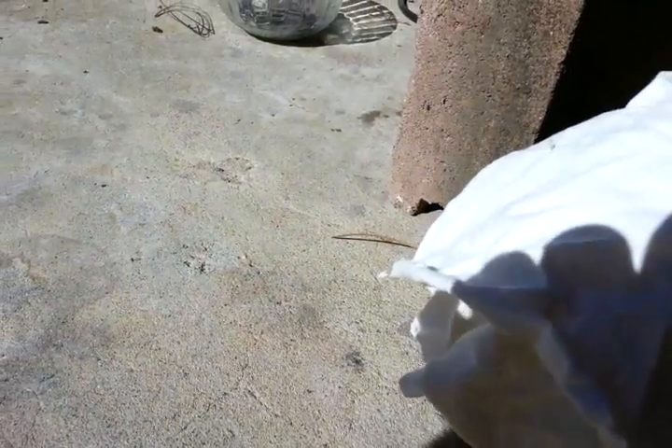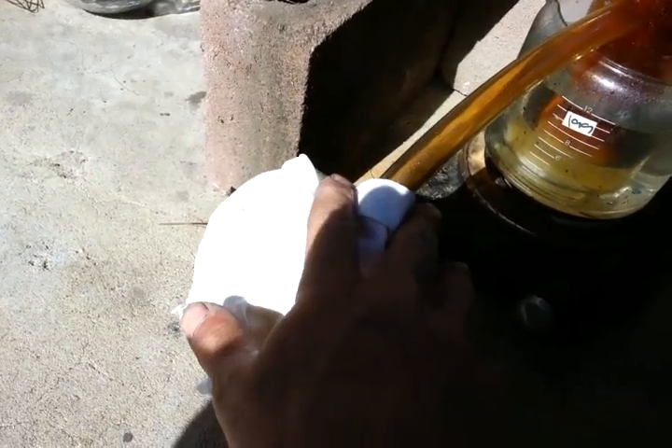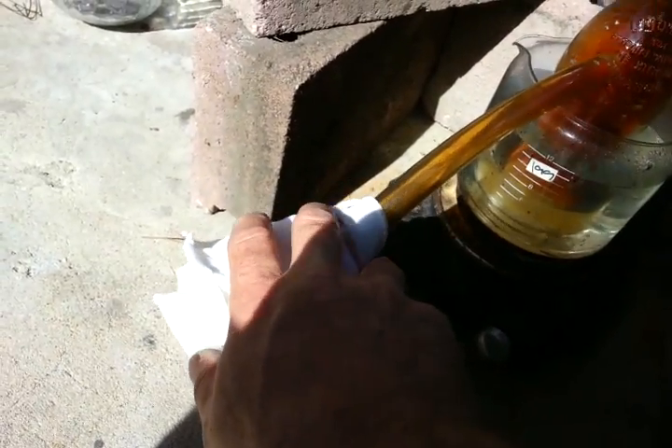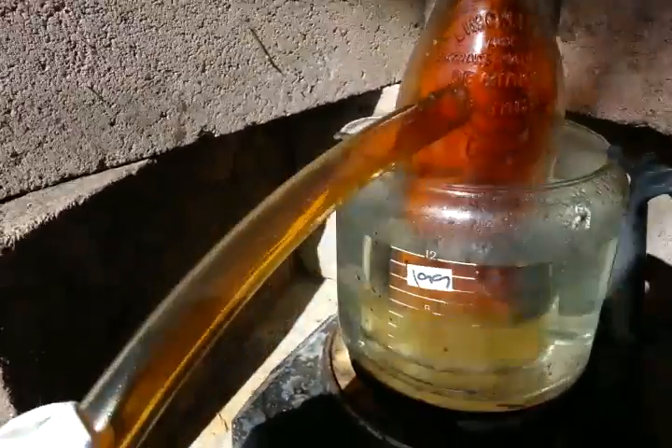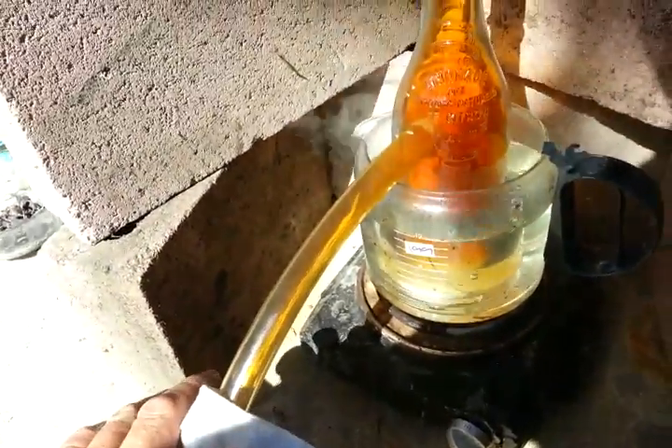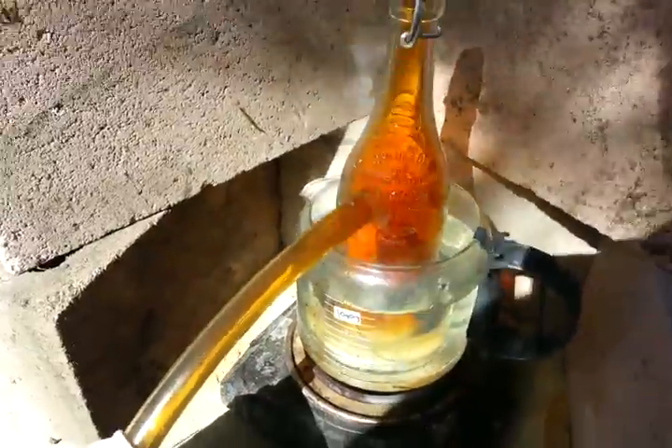Put these on top so it doesn't kind of escape. Put the rag on top. Not that I need a rag — I already cracked a bottle. Over there, you can see it cracked, because I added more water to it. But it still works. Until it works, I'm gonna let it run.